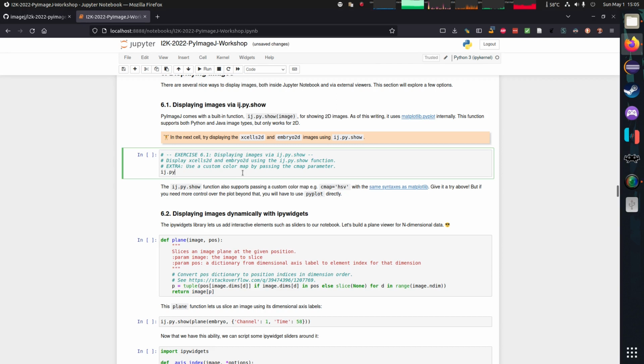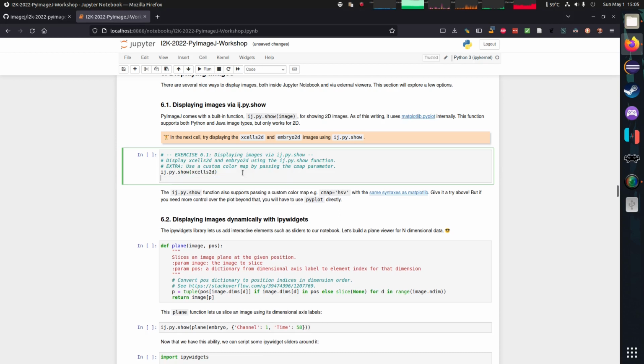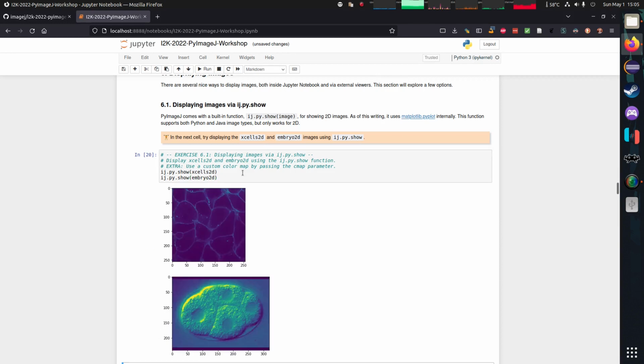Alright, this is pretty straightforward. We just do ij.py.show on X cells 2D, and we do ij.py.show on embryo 2D, and run. There we go.